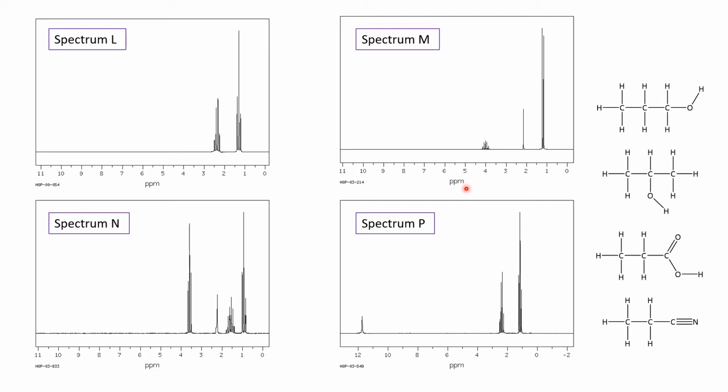So what I would do first is look and see how many broad hydrogen peaks I expect. There are obviously two types of hydrogen in L, three types of hydrogen in M, 4 in N, and 3 in P. So therefore we've got a 2, 2 3s and a 4. Thus we can immediately assign a couple of those molecules just by consideration of the number of peaks.